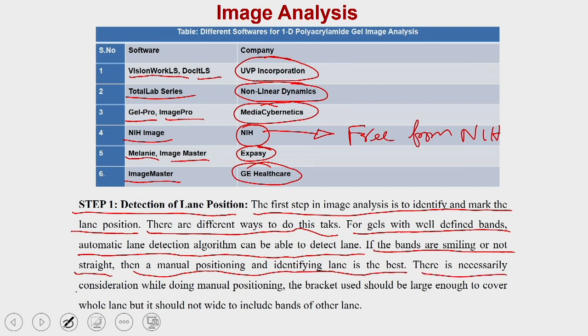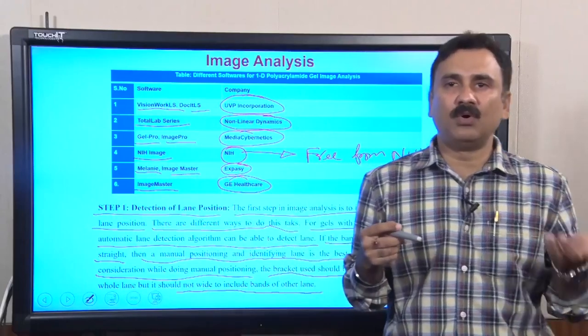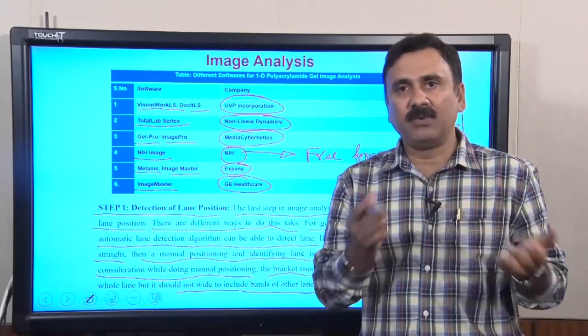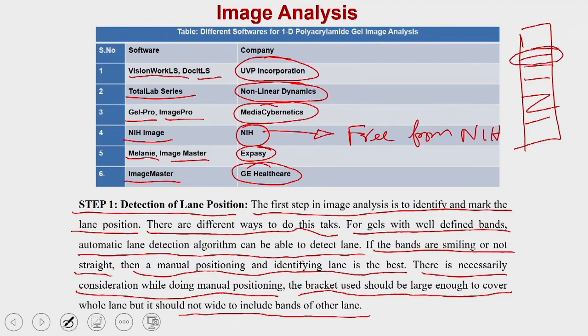If the bands are smiling or not straight, then manual positioning and identifying the lane is best. There is a necessary consideration while doing manual positioning. The bracket used should be large enough to cover the whole lane, but not so wide as to include the bands of the other lane. So if you have discrete bands, you can use the automatic mode to select the lanes. But if the lanes are merged, or you have smiley bands or some kind of resolution problem, then you have to manually select the bands. When you do a manual selection, you have to ensure that you select the bands with the proper width, but not so big that you are selecting the separate band also.